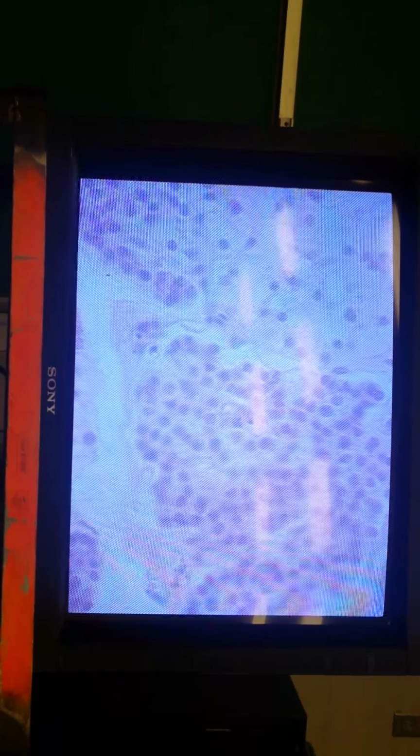Okay. So the chief ones, like the darker one? The little smaller ones, yeah, don't have as much cytoplasm. What else might you mistake this for? At a lower magnification, maybe, but it won't be at a lower magnification. You might be prone to think that that's an islet of Langerhans, maybe.